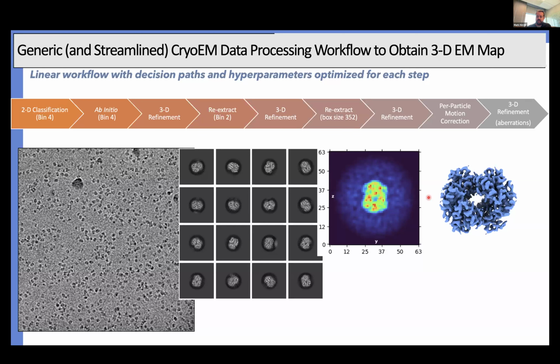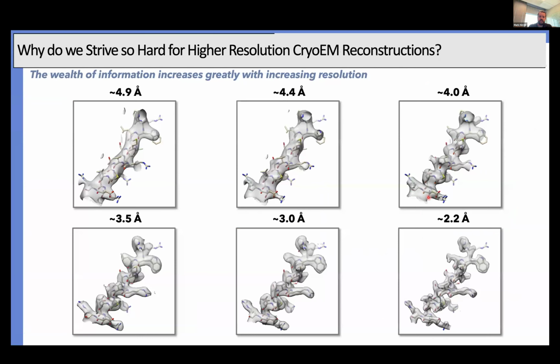And I would say at the end of the day, once you have your final cryo-EM map or maps, if you have buyer's remorse, you don't want to start over in this entire process. And rather, you want to say, okay, I have my half maps, I have my final EM density. What can I do to improve the map? What can I do to interpret it the best I can? And what can I do to build the best atomic models using the software packages that we just were made privy to?